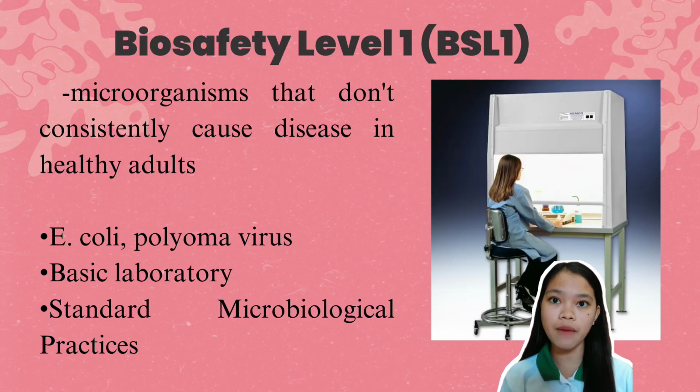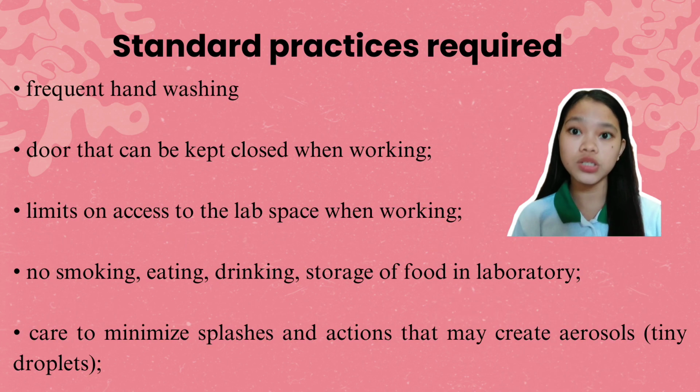First, biosafety level 1. Microorganisms that don't consistently cause disease in healthy adults, such as E. coli or polyomavirus. Basic laboratory, standard microbiological practices. So these are the standard practices required.